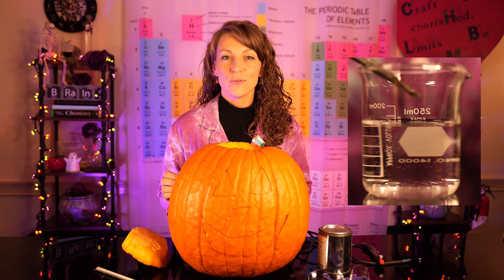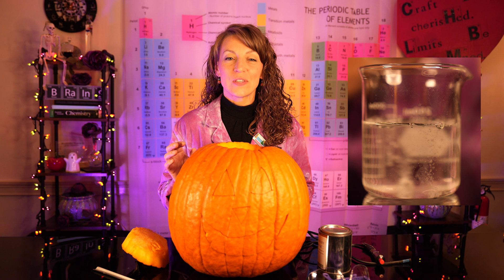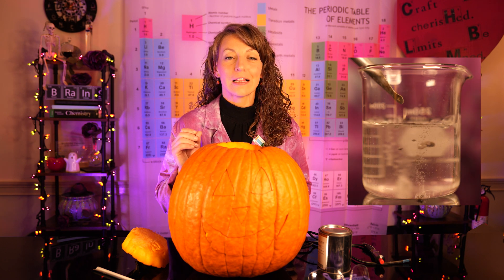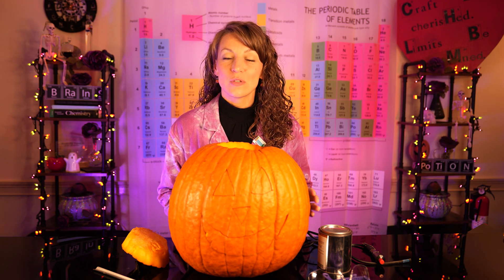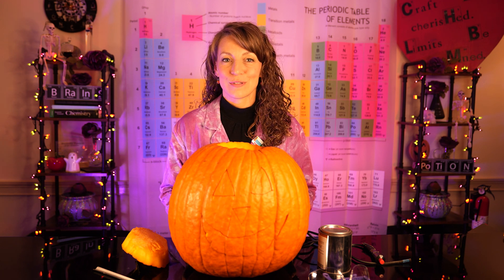Let's add a little calcium carbide into water that's already sitting in our pumpkin. As soon as that solid calcium carbide hits the surface of that water, we start to see bubbling and hear lots of fizzing sounds, which is a really good indicator that lots of acetylene gas is being produced.